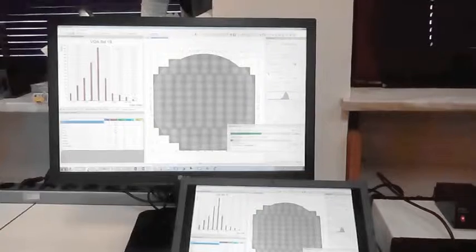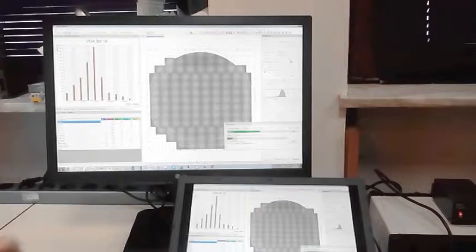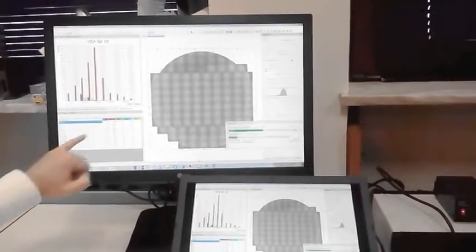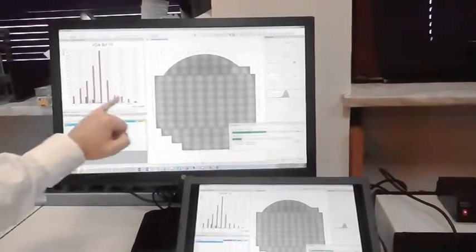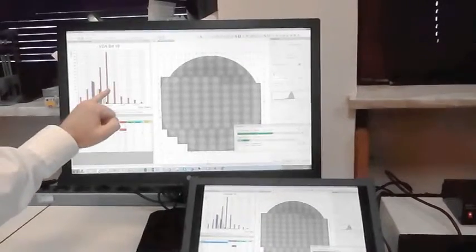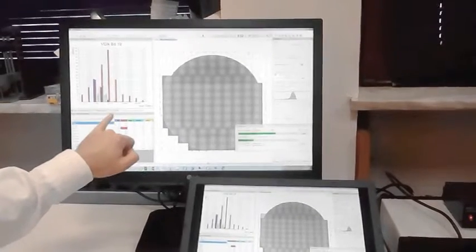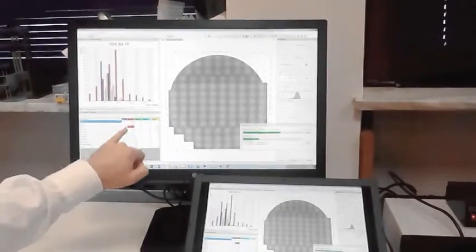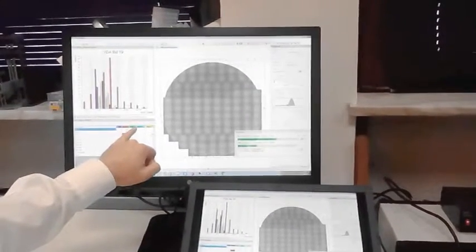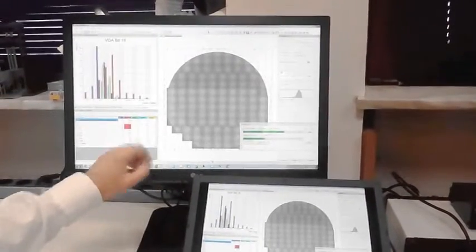This now will suppress those reflections from the metallic particles. So the software is looking for changes in the value between the first measurement of those particles and the second, and it's looking for the difference. What we can start to see now is that our histogram is beginning to build here. I mentioned earlier that our red line is the threshold of VDA BD19, and we have this color coding here, which is very nice. The blue is the count of everything, the red is the maximum, and then fibers are green, metallics are this cyan color, and other classifications are yellow.